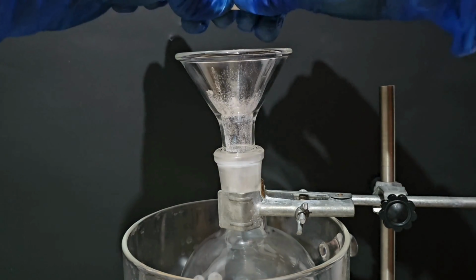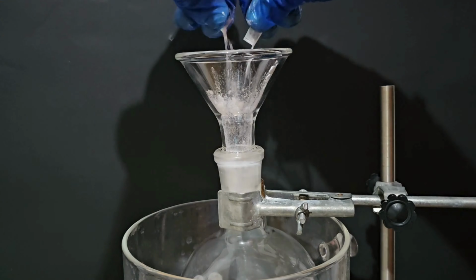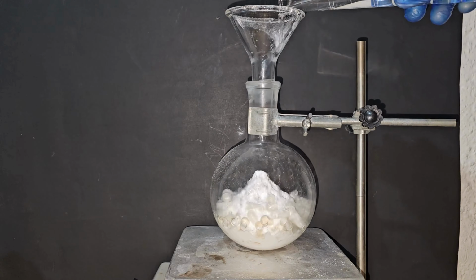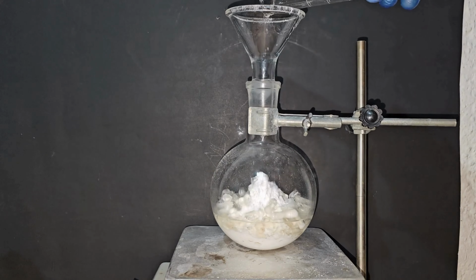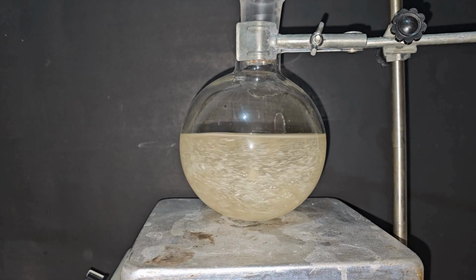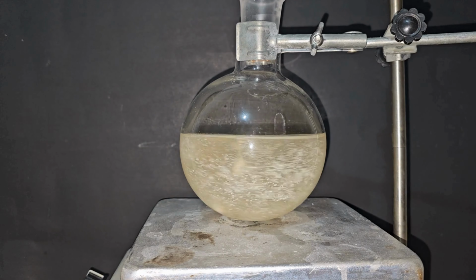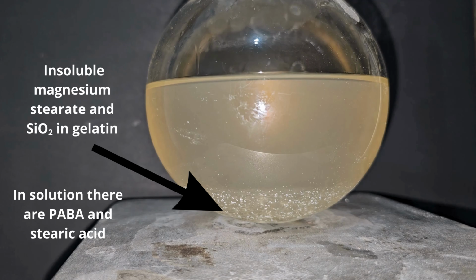First, open the capsules and place everything inside a large round-bottom flask. Then, pour 250 ml of methanol. Start mixing with a stir bar vigorously. After approximately 30 minutes, the solution looked like this. The gelatin of the capsules almost disappeared.